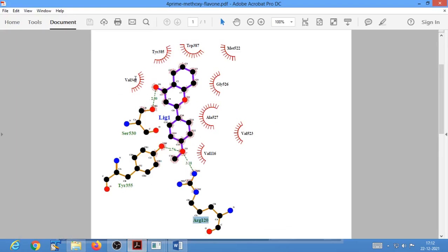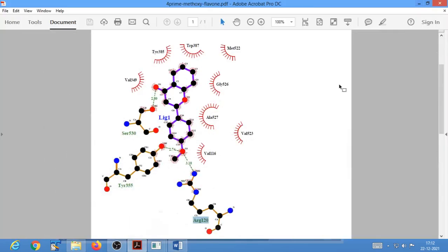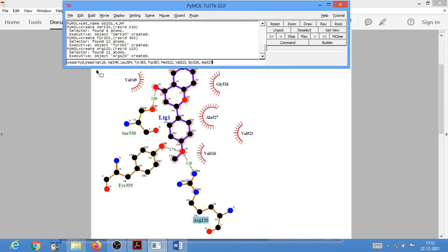Okay, so you have to make sure that they are present in serial order when you write them in this list. Okay, you have to do that as your homework, right? So I would copy this, and I would paste it, right?